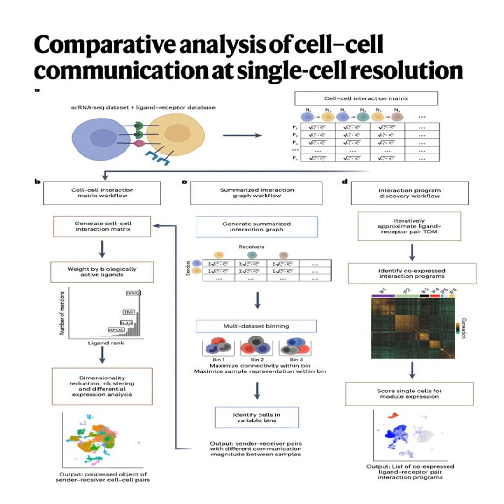How does keeping single-cell resolution help track a sequence of events? Yeah, this is where the concept of longitudinal communicative circuits comes in. It's about connecting the dots temporally. Okay, how does that work? It tries to define a chain reaction.